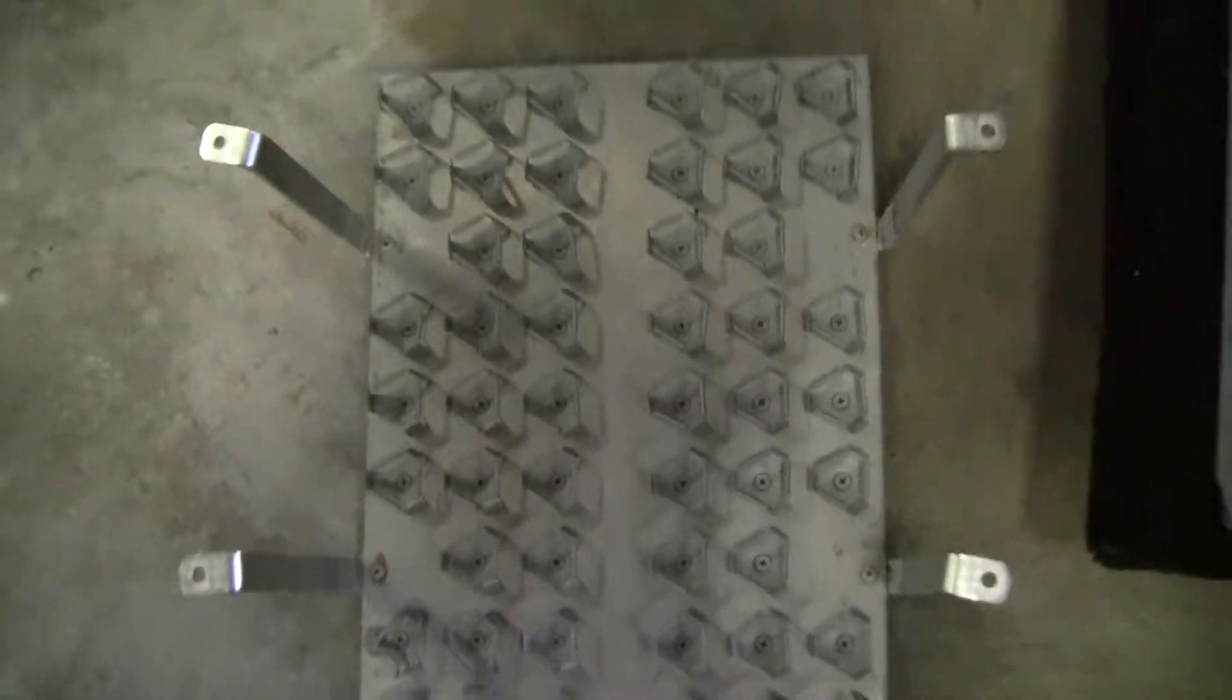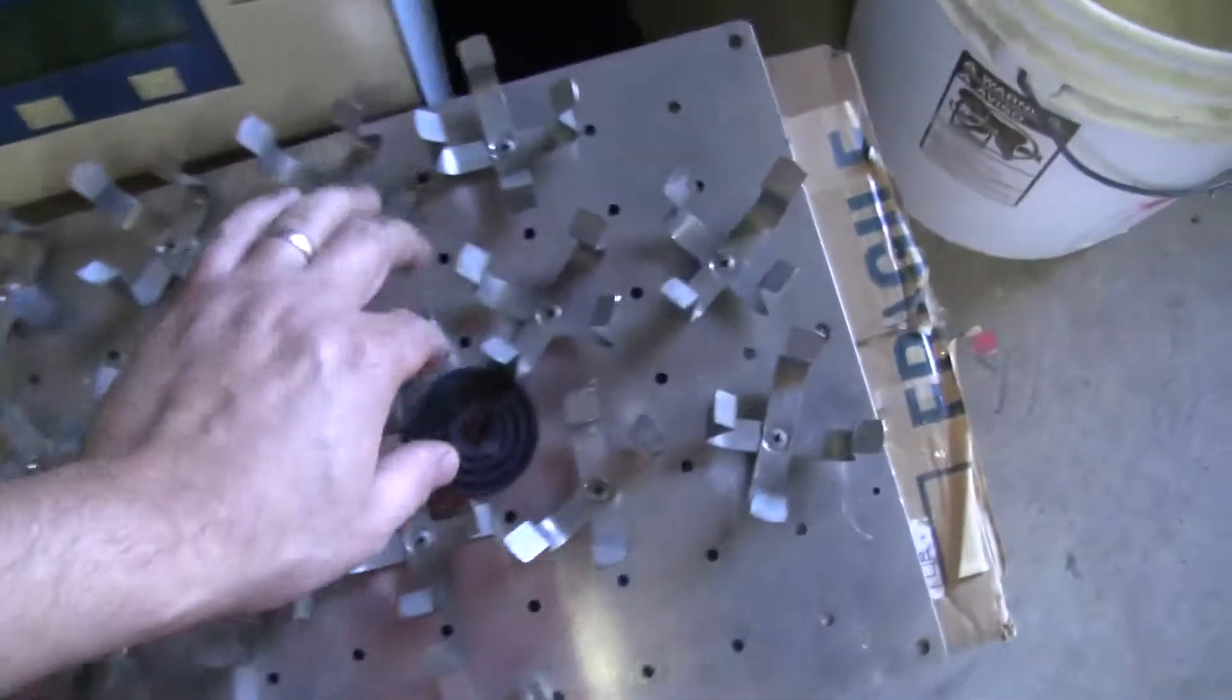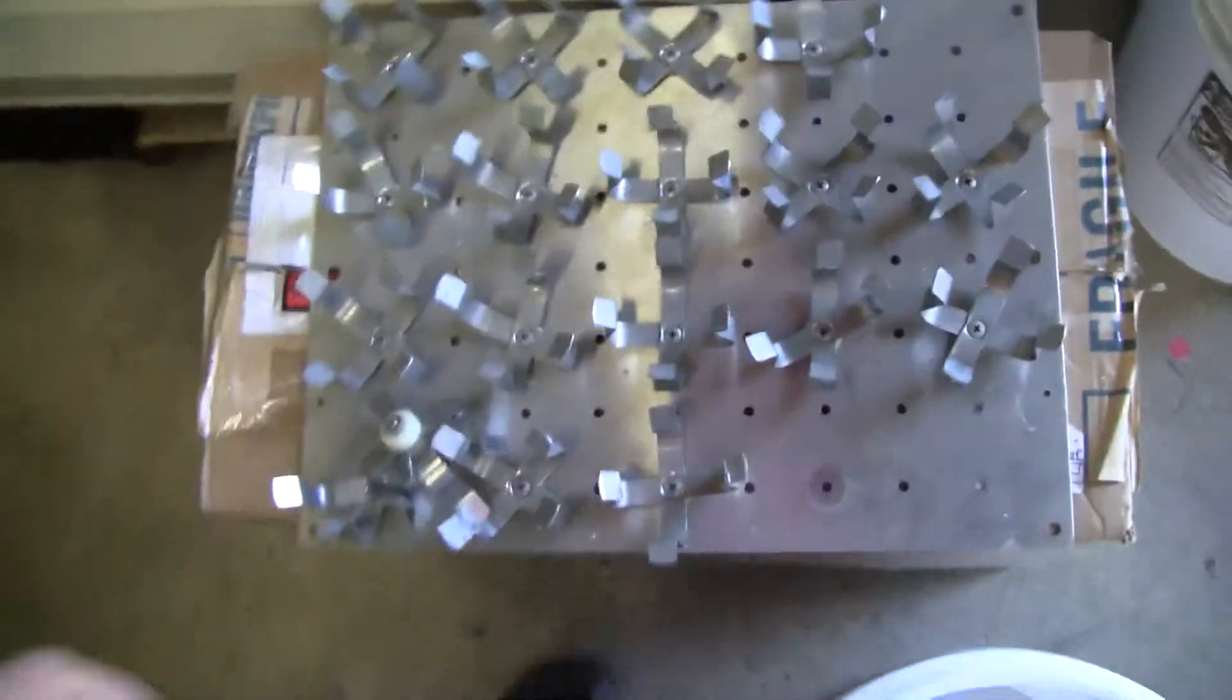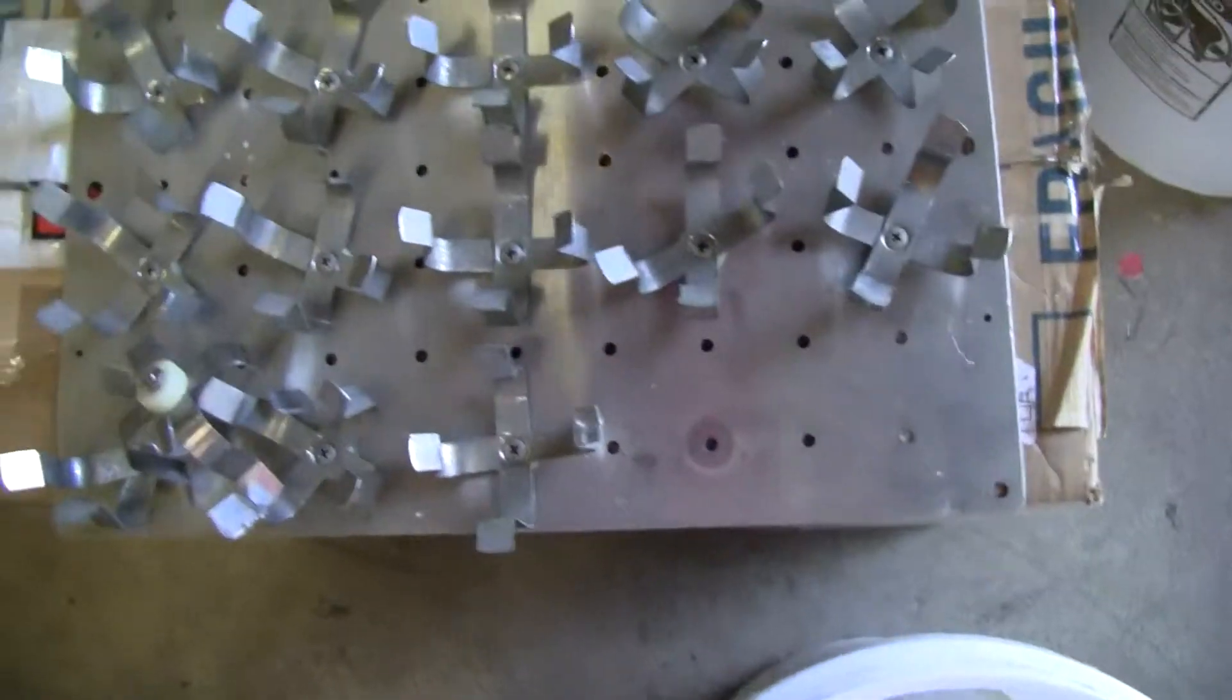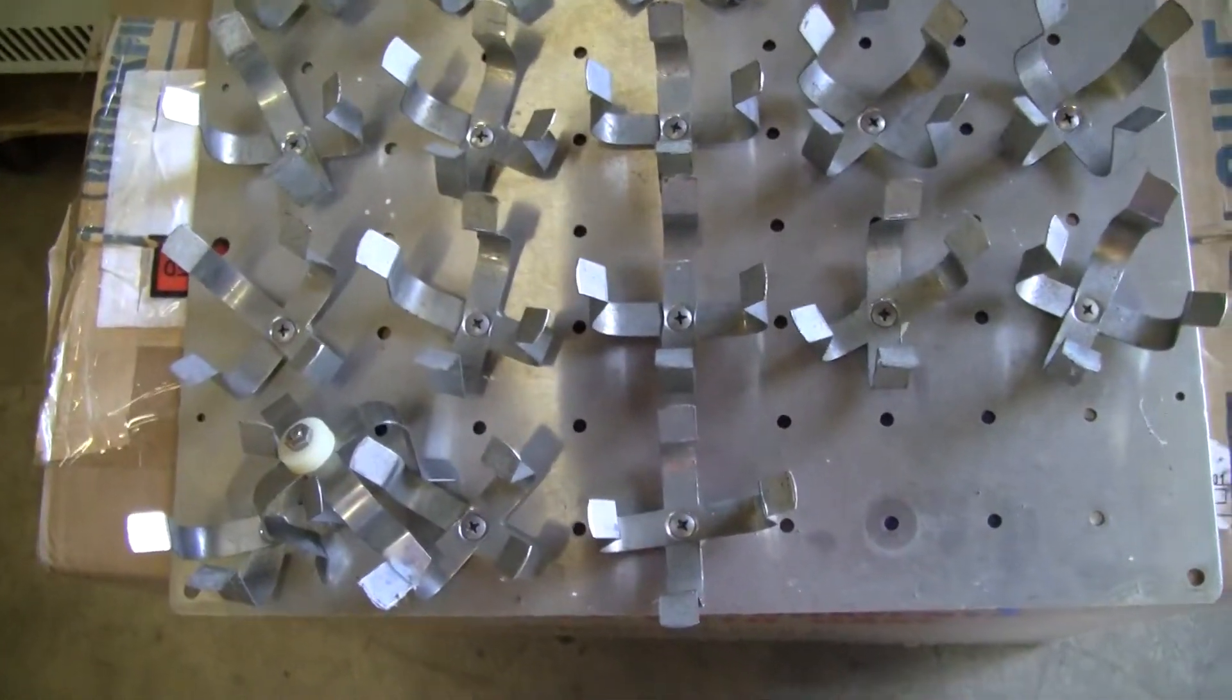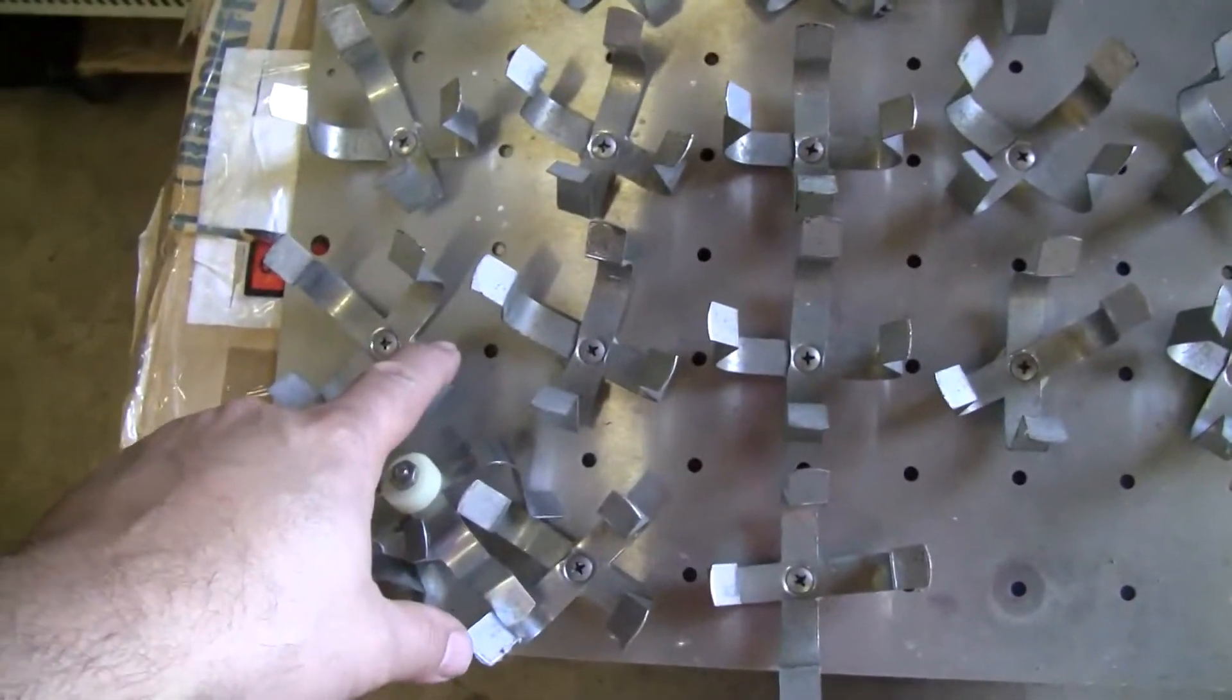The difference is, this particular tray set is called a universal tray set. The holes are more set up in a random spacing where you can take some out and put other holders in.